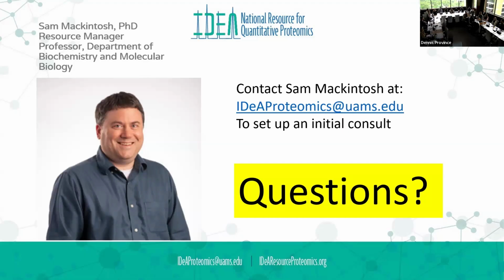So TMT is the new one? TMT, by having those isobaric tags, is a much better way to quantitate for a DDA experiment. And then DIA can quantitate at the MS2 level, and that's a really good way. Thank you.